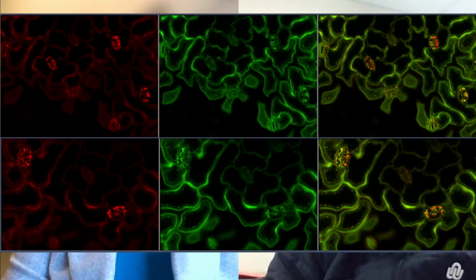The main focus in our case is that we are screening medicinal and herbal plants on different cancer cell lines, and we image these samples, mostly cell cultures or cell lines, to see if we can start to see some developments and some other interesting things using different stains, staining different parts of those cells like filaments and nucleus.